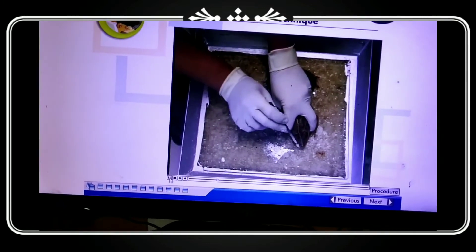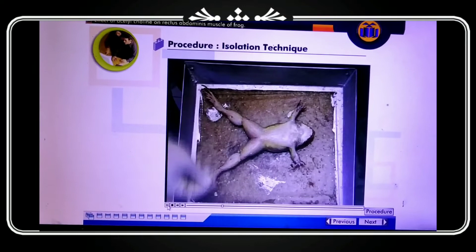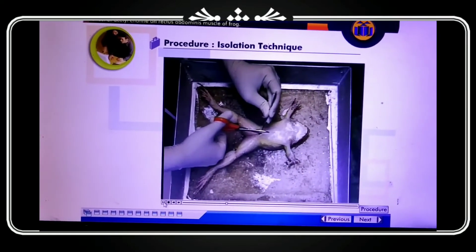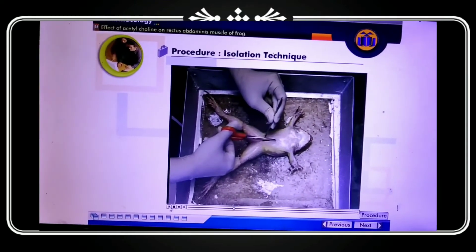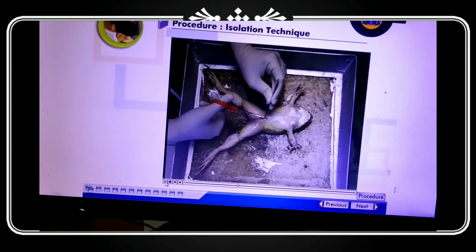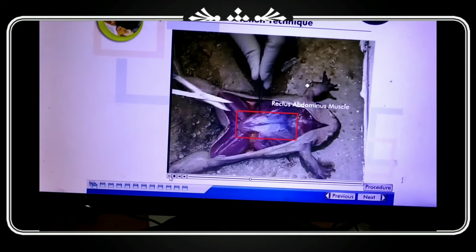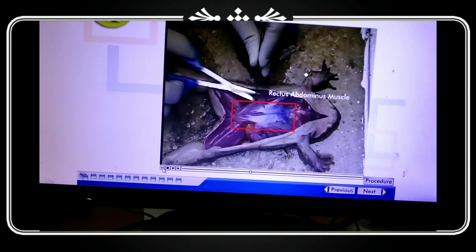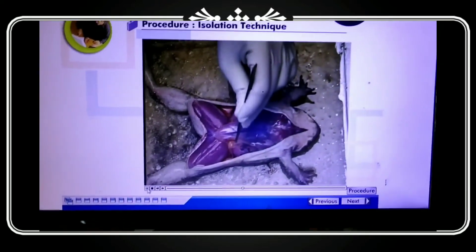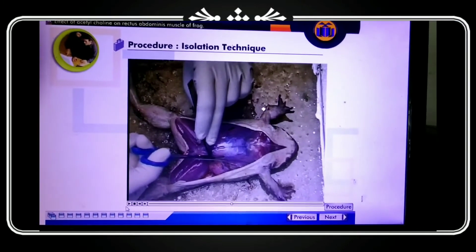The spinal cord and brain connection is broken — that is, the sensation is lost. We check this with the help of a pointed pithing needle. On the stomach side of the frog, we check the abdominal muscle with the outer skin, then cut with scissors. We observe the rectus abdominis muscle of the frog, which is the muscle used for movement. This portion will be cut and used for the experimental purpose.